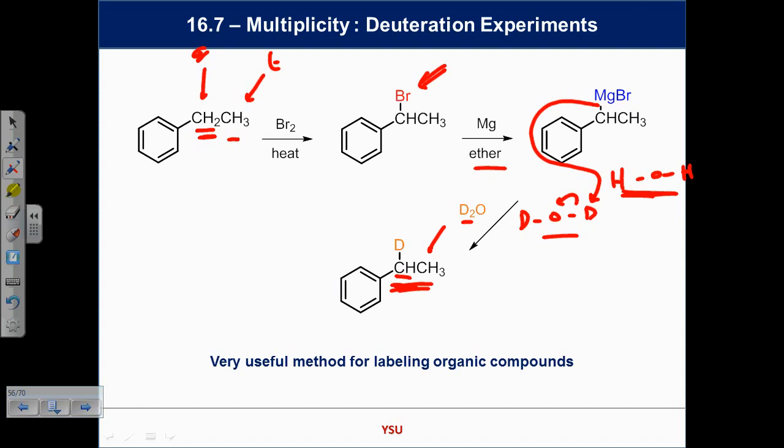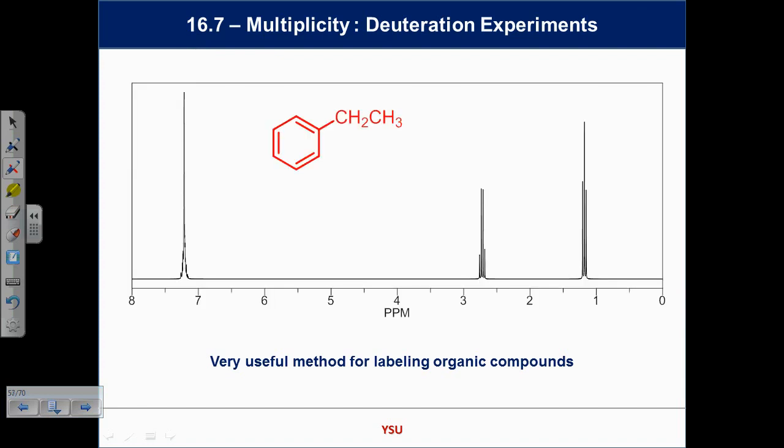So we can do this with ChemDraw. We can plot these things. There's the NMR spectrum plotted for the starting material. You can see the CH2 and the CH3. Which one is the CH2 group? Is it this one down here or this one up here?